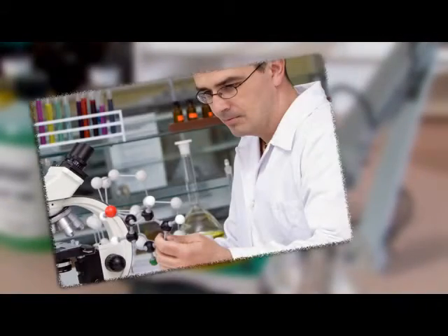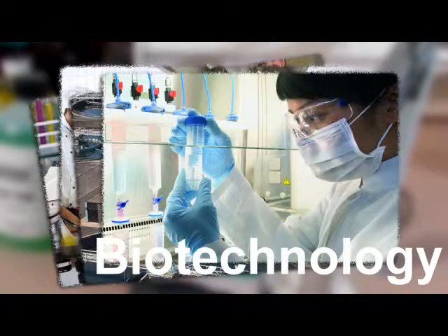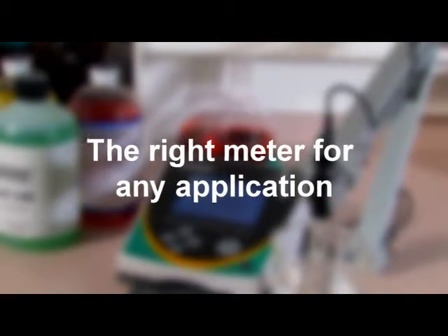Whether your laboratory handles research and development, food testing, water and wastewater, biotechnology, pharmaceutical or other industries, the Oakton 2700 benchtop meters offer features that respond to your demanding requirements.